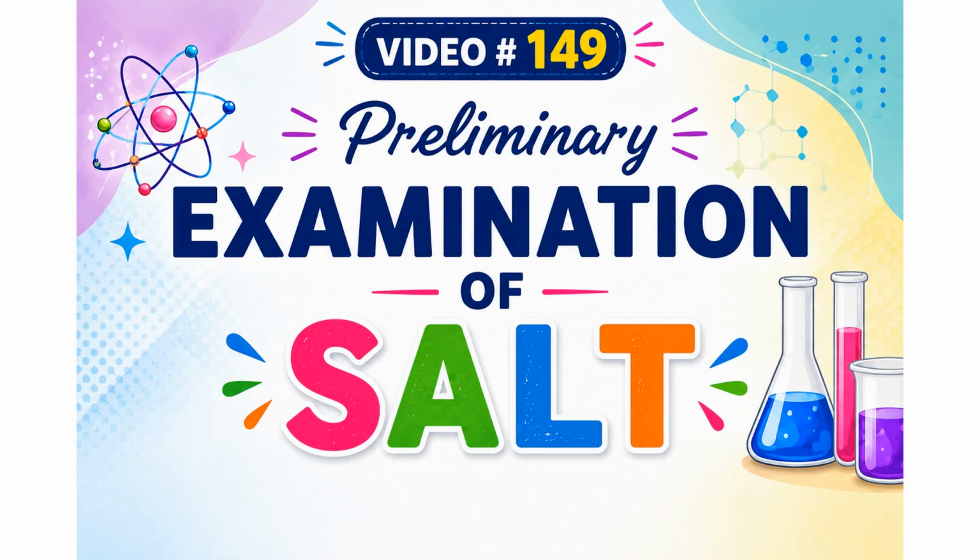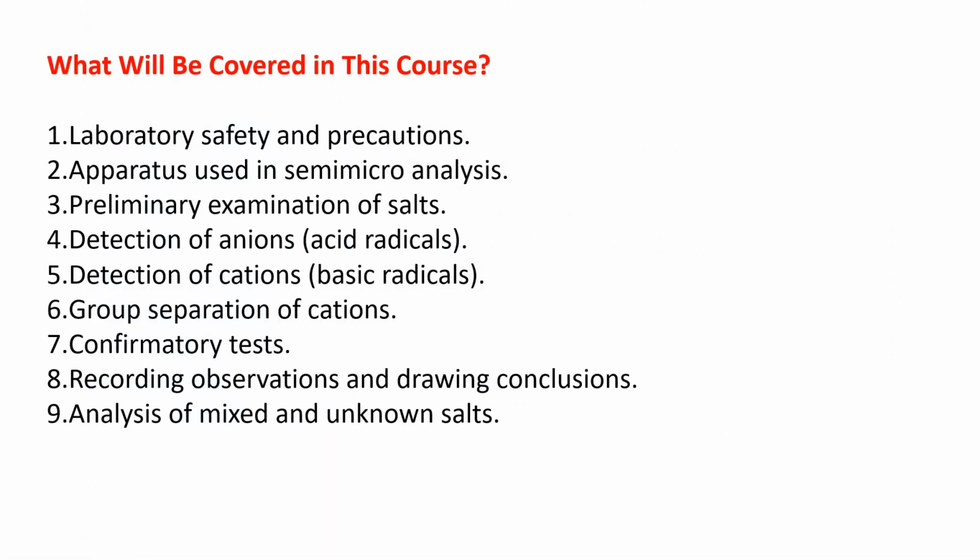This is the second video of the course Inorganic Semi-Micro Analysis, and here I am going to discuss a few preliminary examinations of the salt. So let's see. This slide I have already shown you earlier, what topics will be covered in this course. Among these, laboratory safety and precaution is already done. Apparatus used in semi-micro analysis I have also done in my earlier video, and today I am going to discuss the preliminary examination of the salt. Three preliminary examinations we will discuss today. So let's start.